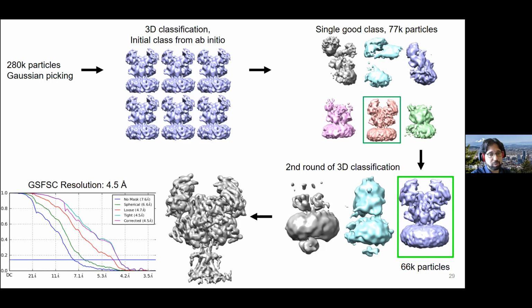But also we do a pretty fine patch motion correction. So we used to do 5x5, then went to like 9x5, and now we are doing like 14x11. So these are pretty small squares, so that already looks a little bit like per particle motion correction to some extent. So we haven't noticed any improvement from those.